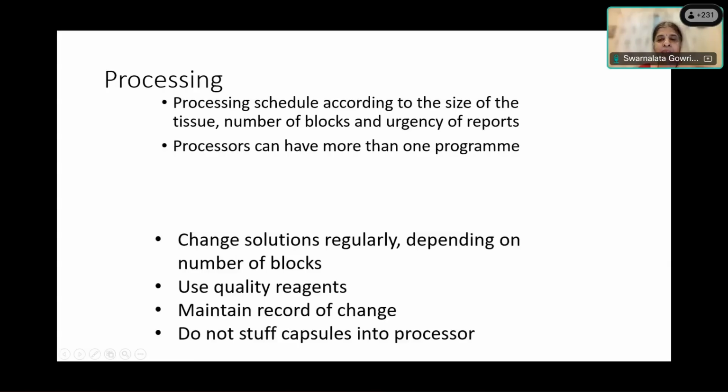You need to know when to change solutions. Solutions don't last forever. Every week, every couple of days, depending upon how many blocks you process. Reagents should be of quality. Only then is it well processed. You have to maintain a record of the change.